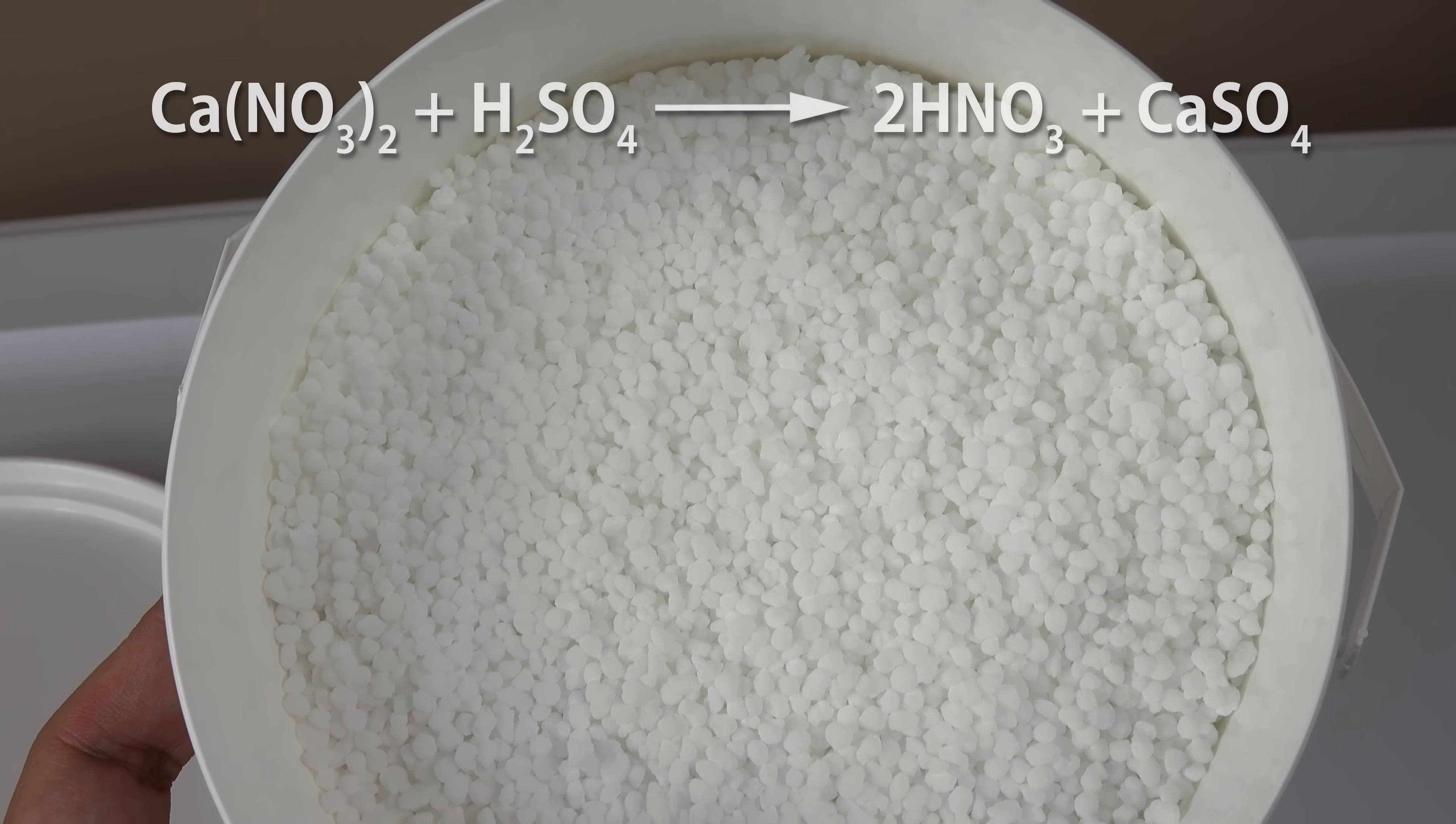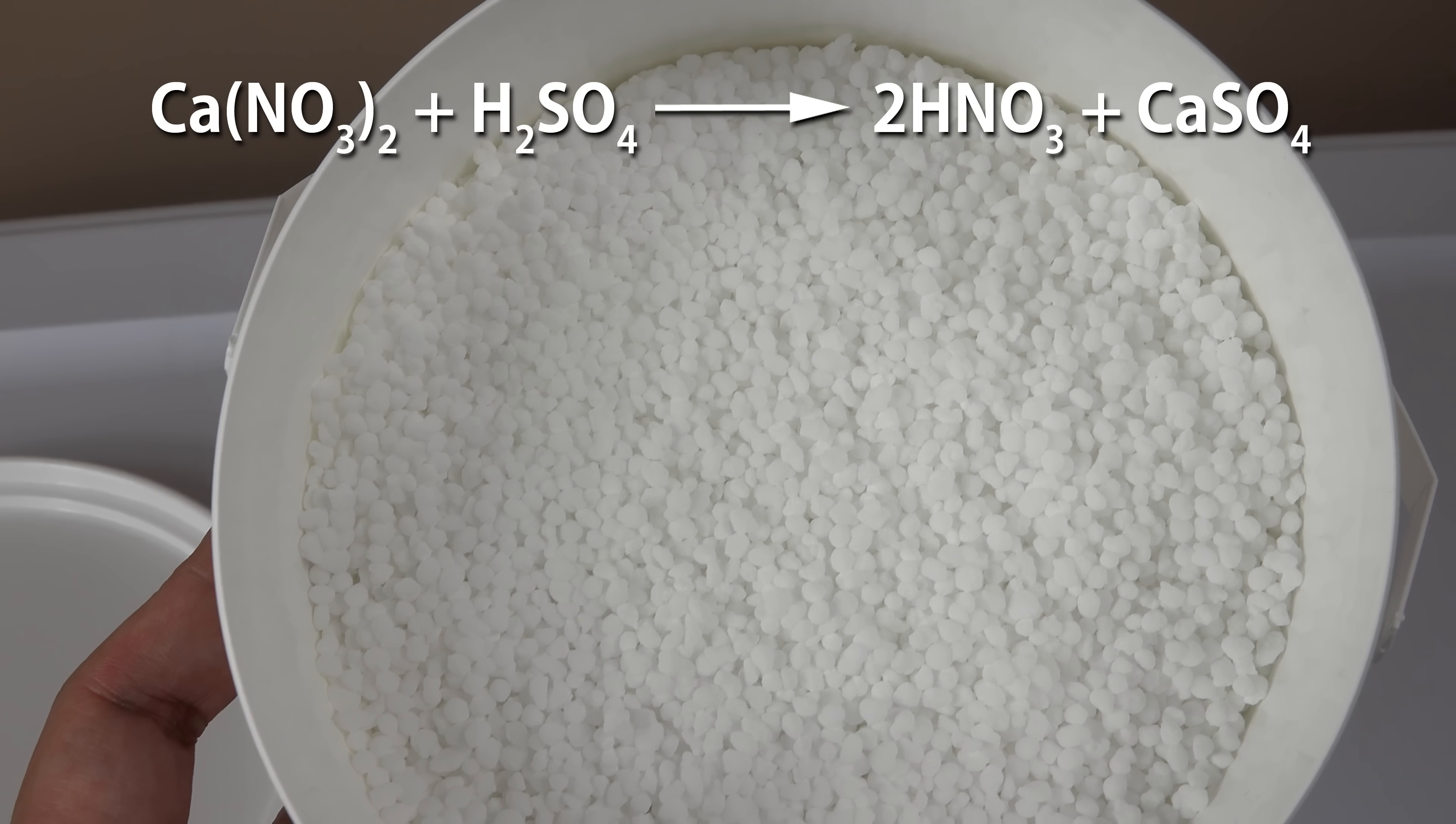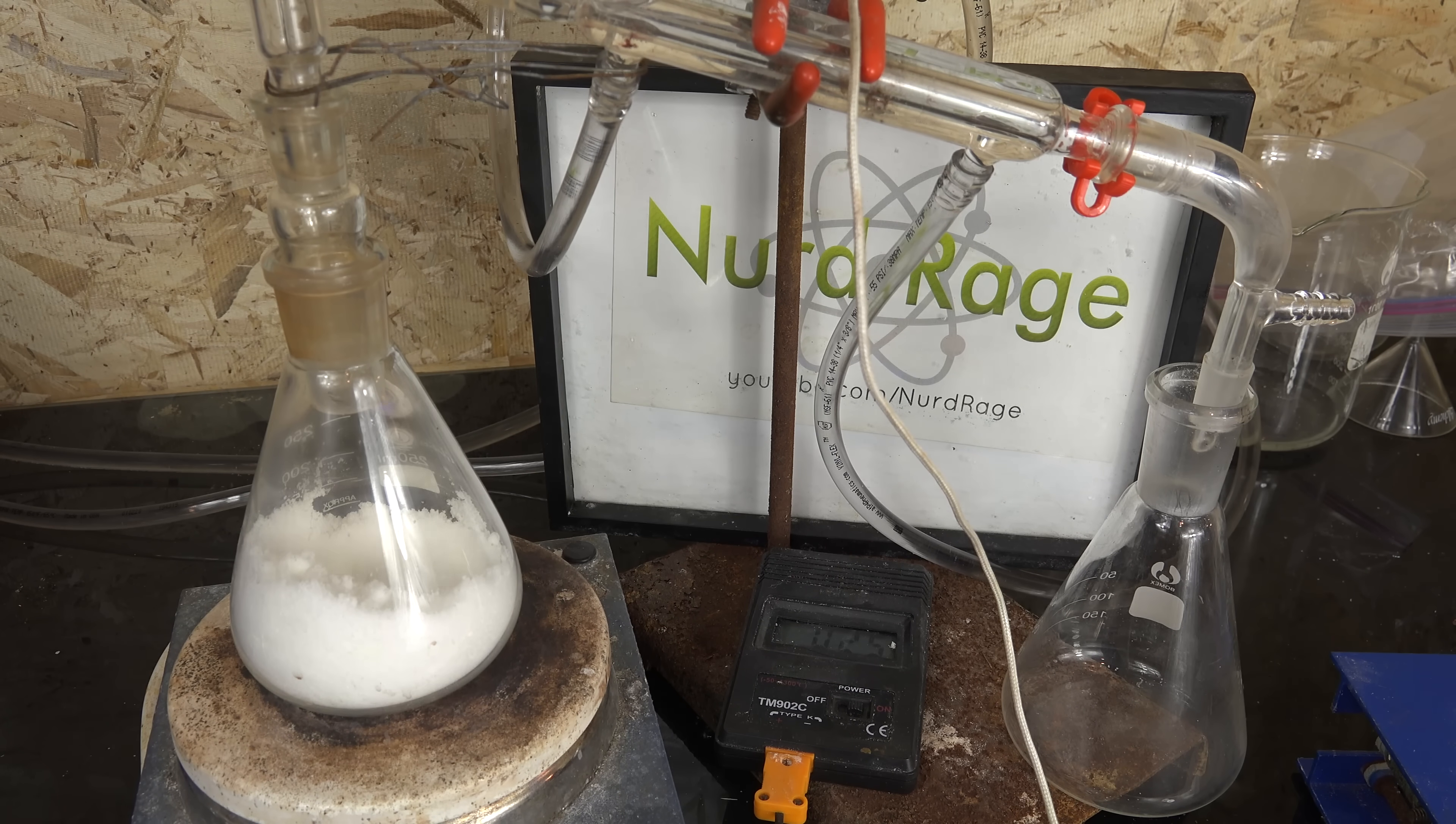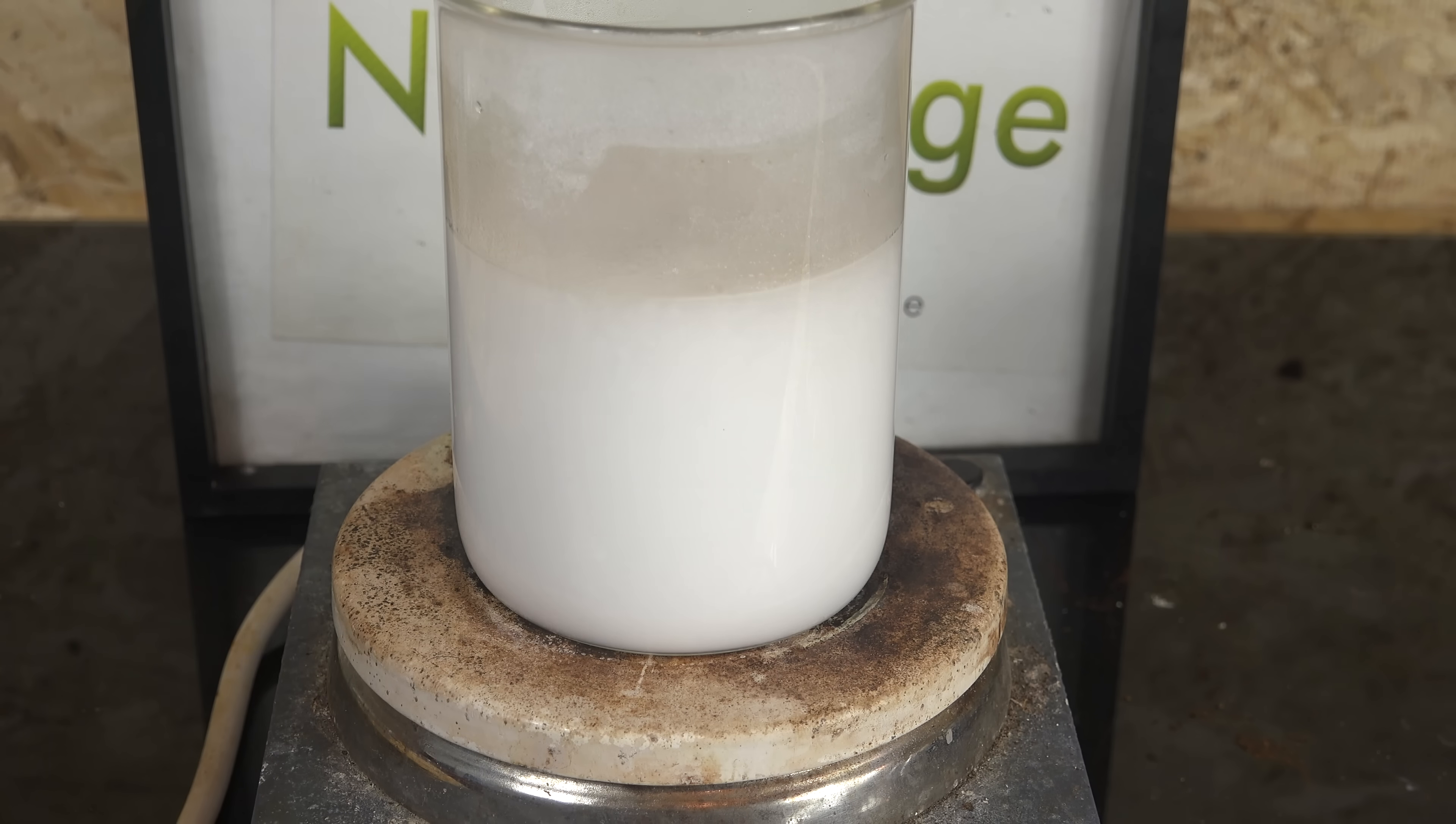But when used with sulfuric acid, calcium nitrate forms calcium sulfate and nitric acid. While this does produce nitric acid, the major issue for the amateur is the calcium sulfate produced. Calcium sulfate is an insoluble rock and is in fact used as a plaster. If it's stuck inside a flask it needs to be drilled out and for this reason calcium nitrate and sulfuric acid are almost never mixed directly. Instead, they are first mixed separately in water and then mixed and the calcium sulfate precipitates out as a powder that can be filtered.